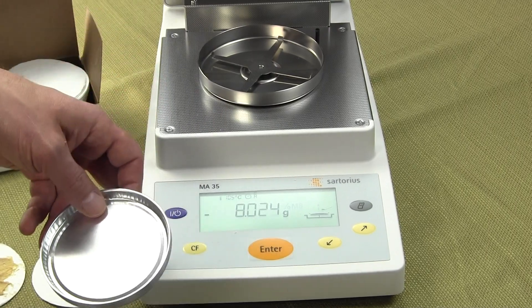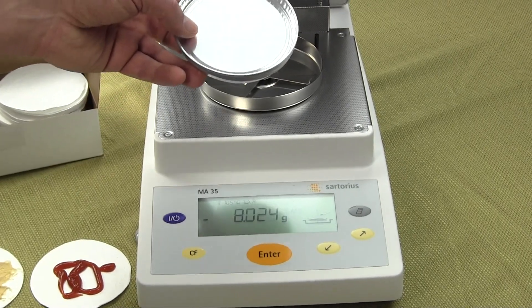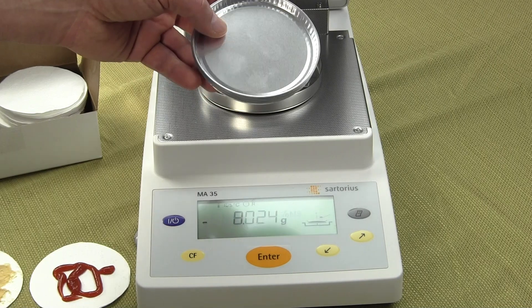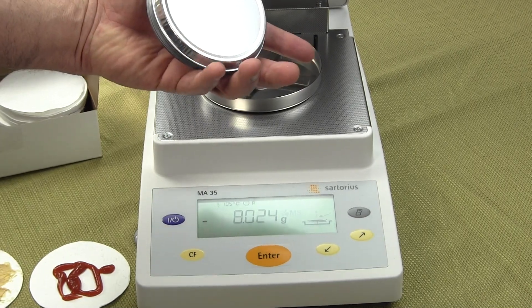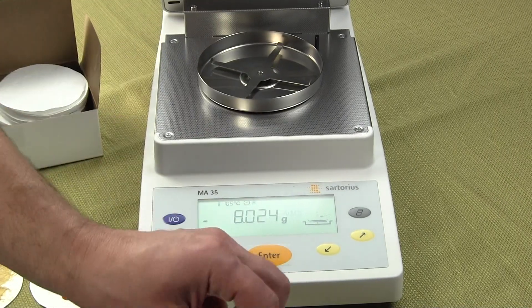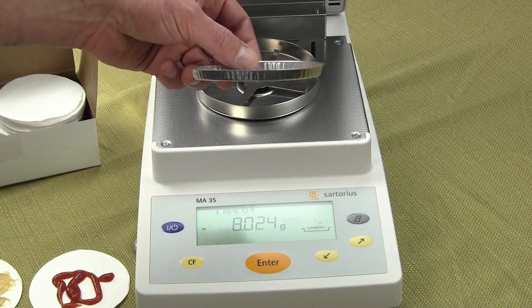This particular moisture balance, the Sartorius MA35, has a maximum temperature of 160 degrees C. The moisture pans themselves have a top diameter of four inches, a bottom diameter of three and seven-eighths inches, a height of five-sixteenths of an inch, and they weigh about 2.7 grams each.